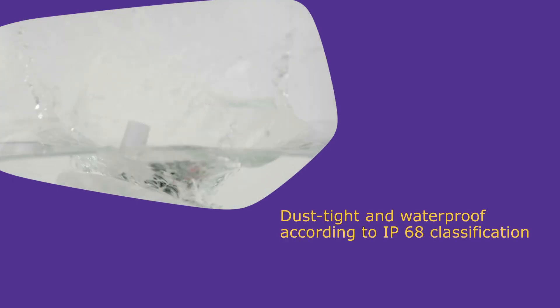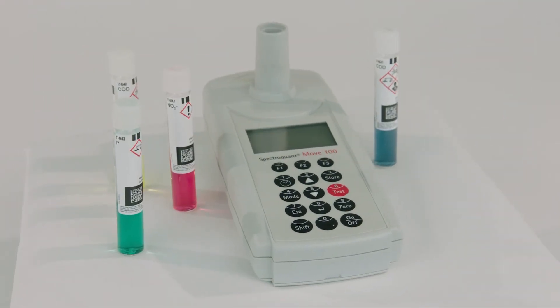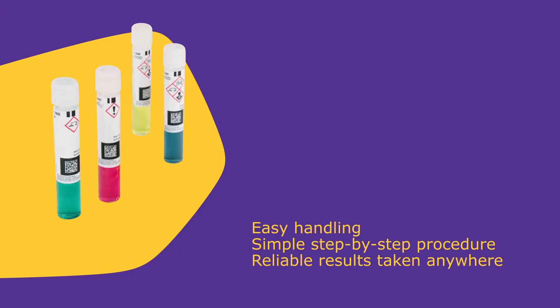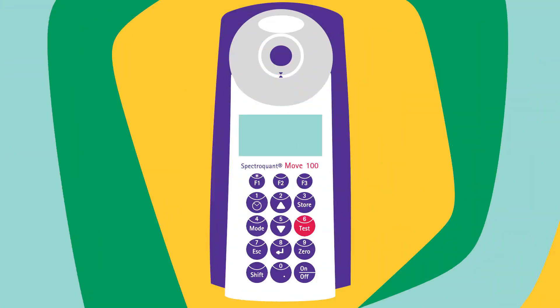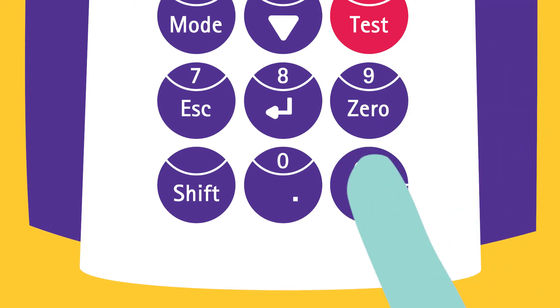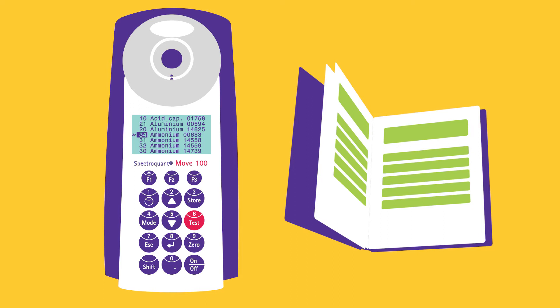The MOVE is completely waterproof and dust-tight, so it can be used in every condition. With the Spectroquant MOVE 100, measurements can be taken anywhere easily with just a few simple steps. The two available cell sizes of 16mm or 24mm provide flexibility in measurement ranges. Turn on the instrument by pressing the ON-OFF button. The appropriate method can be chosen by scrolling through the list or by entering the method number, which can be found in the instrument manual.